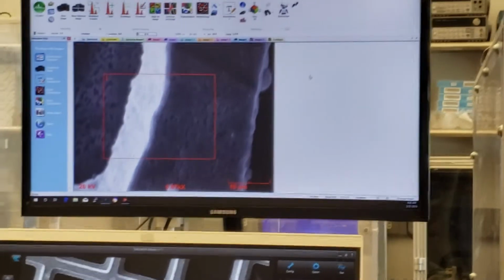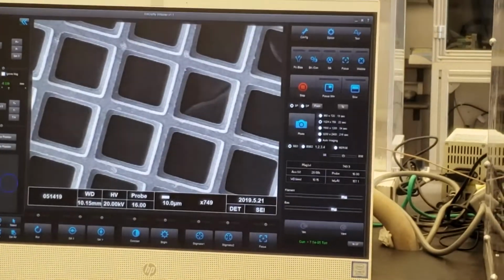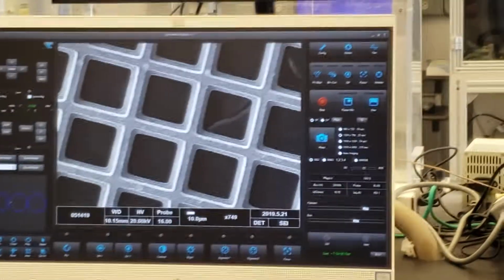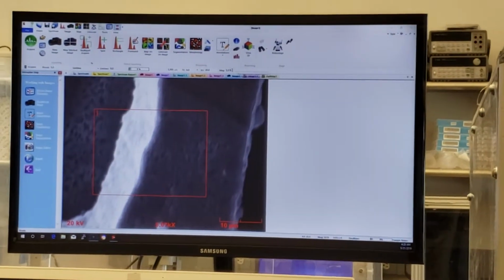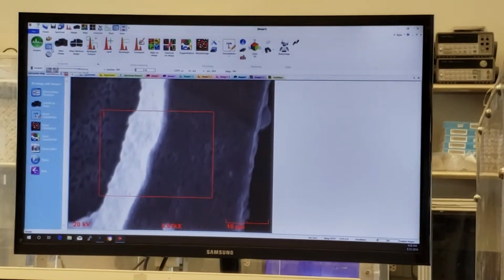Yeah, so again, back to the imaging portion of this, right? So we're just talking about imaging window, and then again we have the segmentation, same thing as the pull down, morphology, same thing, and then just some manual features, manual processing, like if we require this image here, change the mag 749. Let's grab the new image again.